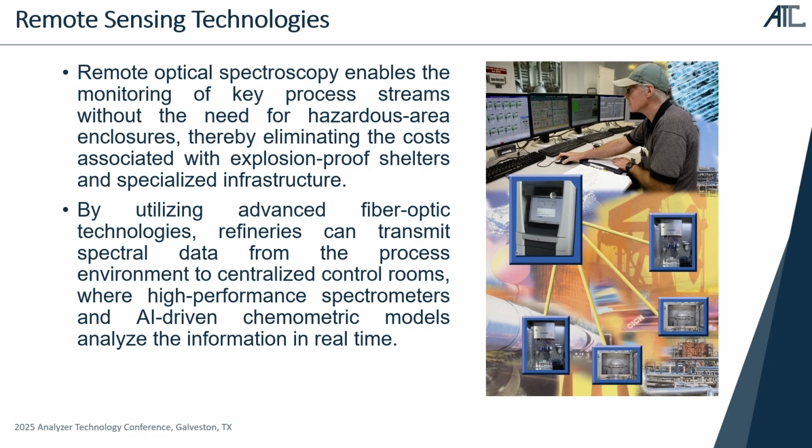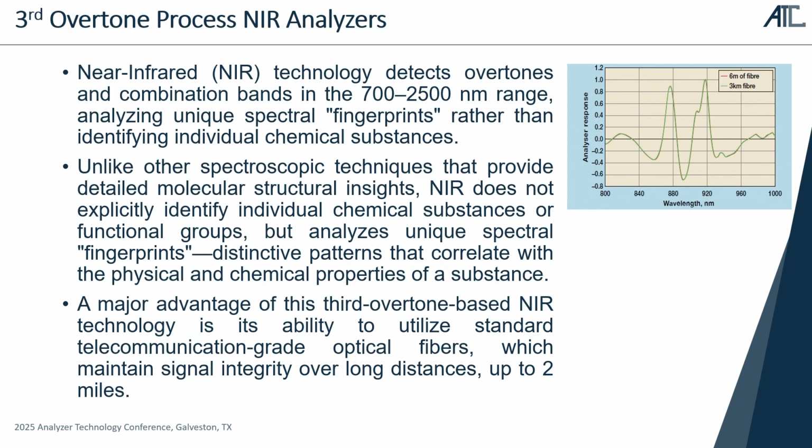And in order to develop such a technology, it was necessary for us to carefully evaluate all the necessary methods, including the near-infrared. Now let's talk a little bit about near-infrared. Near-infrared technology basically goes from 700 to 2,500 nanometers in the spectral range, and we say that this range enables us to see approximately 80 to 90% of the hydrocarbons spectrum.